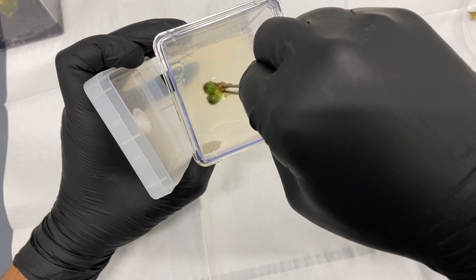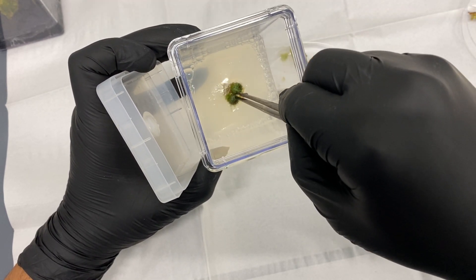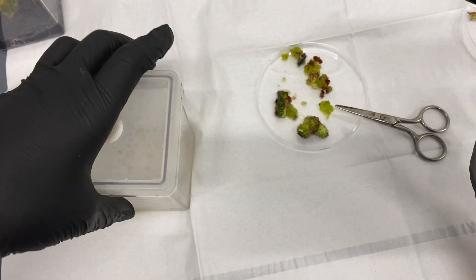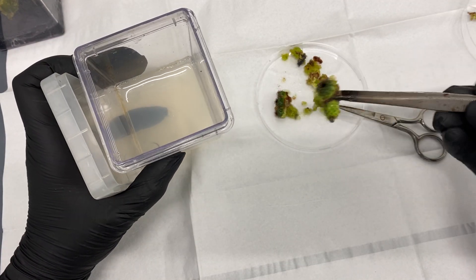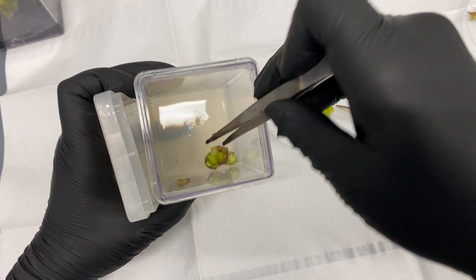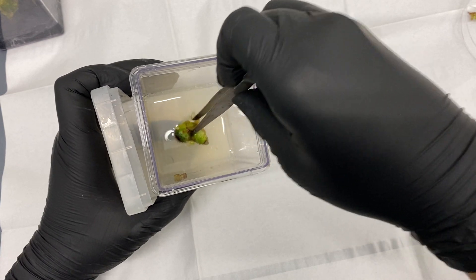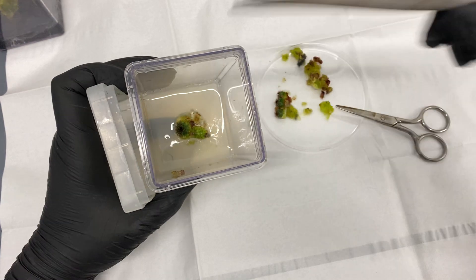We want to keep everything in that gravitational pull, so we're going to push it up and down when inserting. Beautiful — yeah, that's a good one.